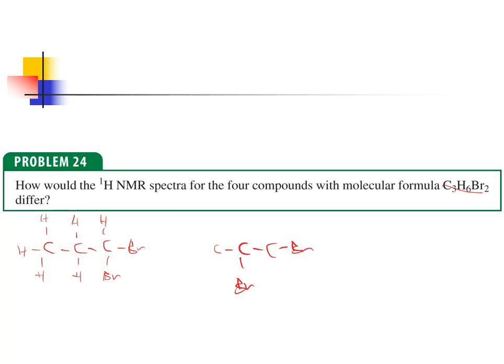Okay, so that would be another option for me. I would still have the same number of hydrogens, same number of spaces that are available to me. That's not a problem. And then if I do it again, I'm going to see this 3-carbon chain, maybe 1 bromine on this side and maybe 1 bromine on that side. So there's a possibility for me. And then I would see 2 and then 4 and then 6 hydrogens, 2 evenly on each carbon.